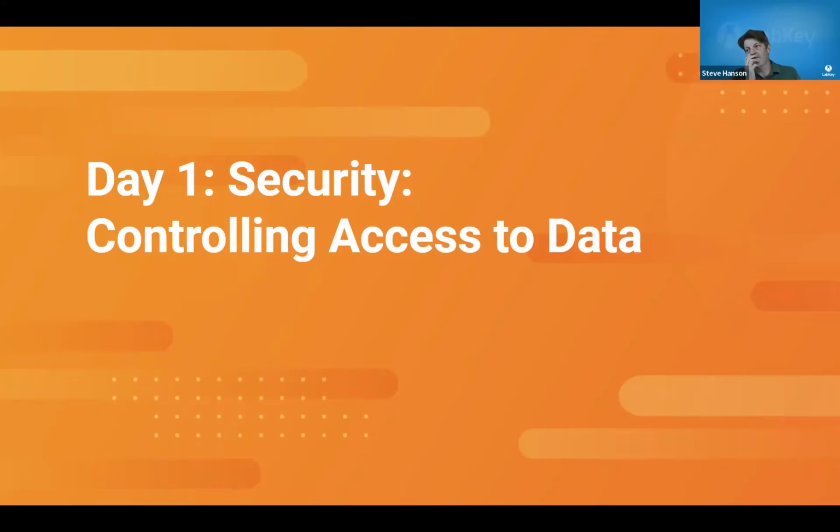Something in between. So there's just a few examples of some domain-specific built-in functionality around assays. There's lots more, and that's what tomorrow's all about. And then there's another question here.